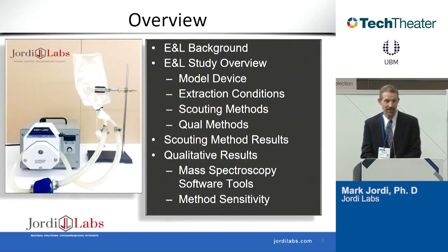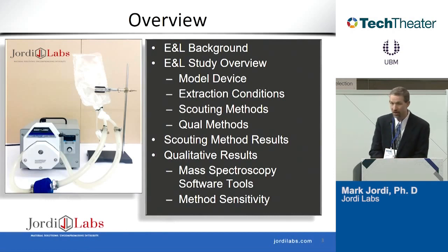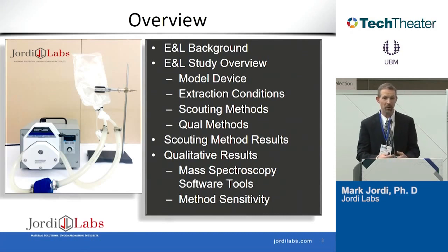So in my talk today, I'm going to cover, first off, E&L background. What is an E and what is an L, and how do you conduct this type of testing? I'm also then going to go through a model study in which we look at a bioprocess system and look at the process and what we found as we actually did an E&L study on this.